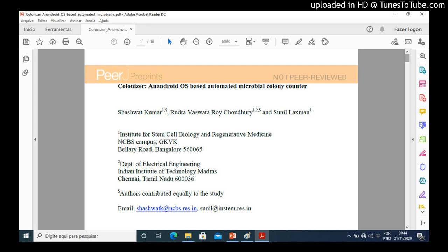Speed. The speed of the application depends upon the processing capacity of the phone used. We tested the algorithm on smartphones with both a very low end Micromax Key 4014 and a higher end processor, the Moto G4 Plus.